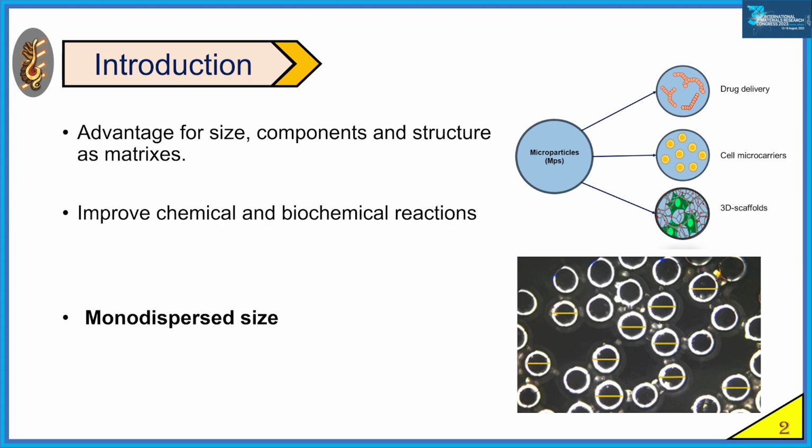Now, the third image shows different applications for microparticles, such as drug delivery, cell microcarriers, and 3D scaffold. And the second image shows the monodispersion in the microparticle generation.